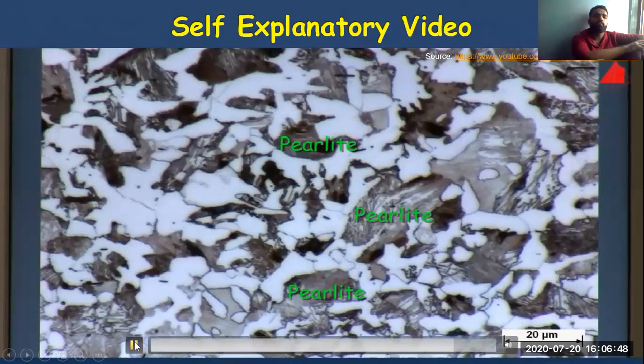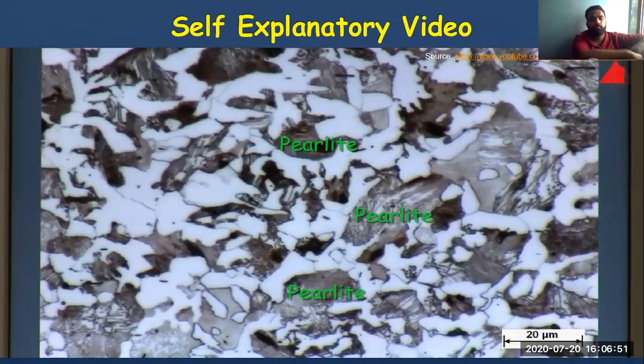Pearlite consists of thin alternating crystals of ferrite and cementite. The white regions are ferrite crystals. They consist of almost pure iron. Great, the etching has been successful. In a similar manner, virtually all materials of our world may be examined.